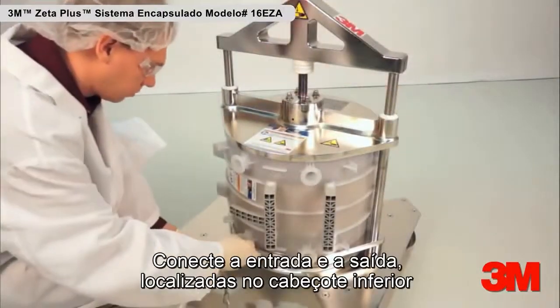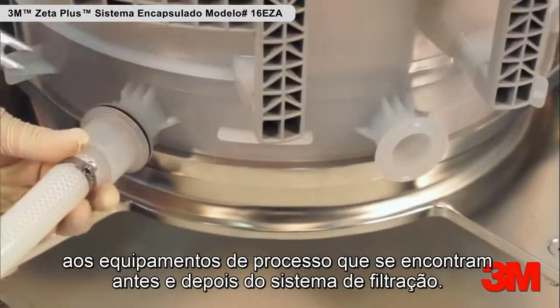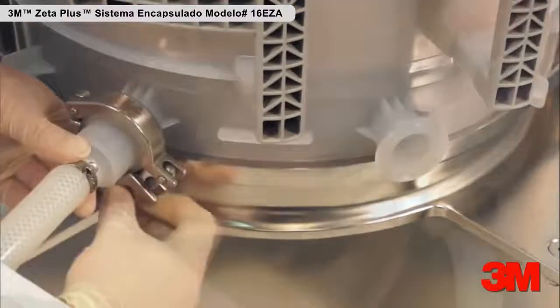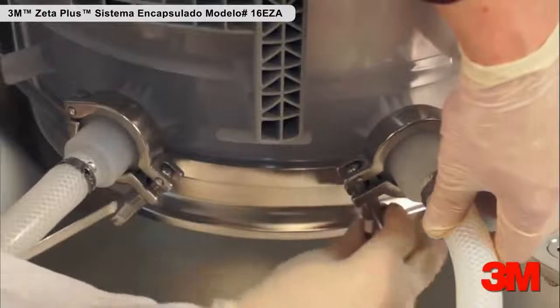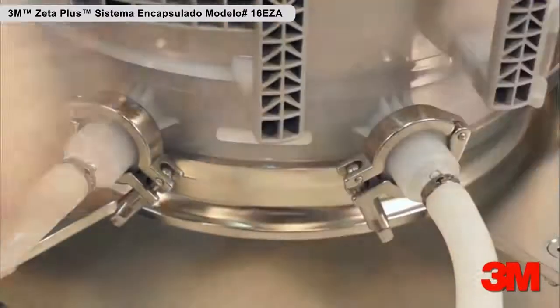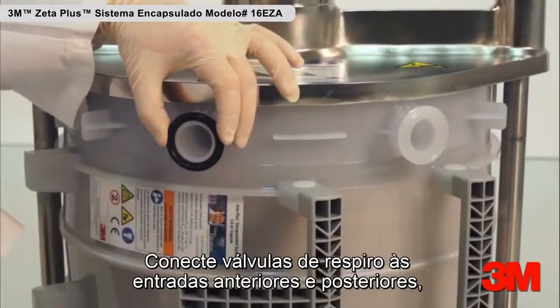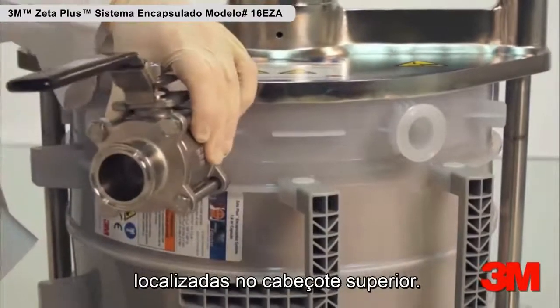Connect the inlet and outlet located on the bottom manifold to the upstream and downstream process equipment. Connect vent valves to the upstream and downstream vents located on the top manifold.